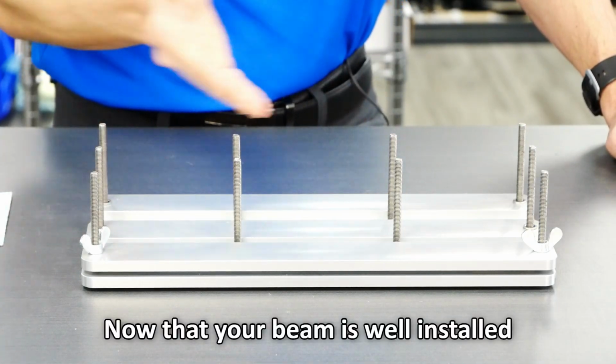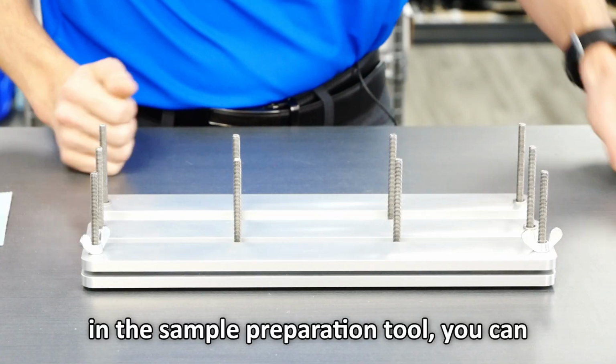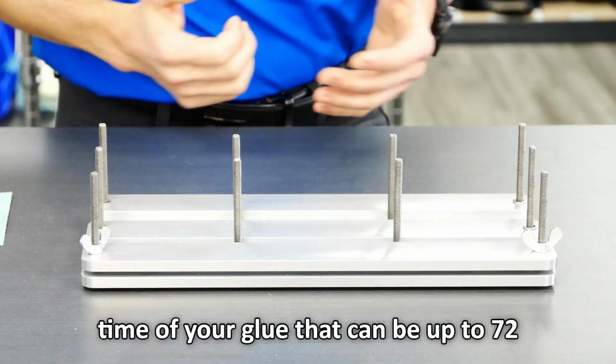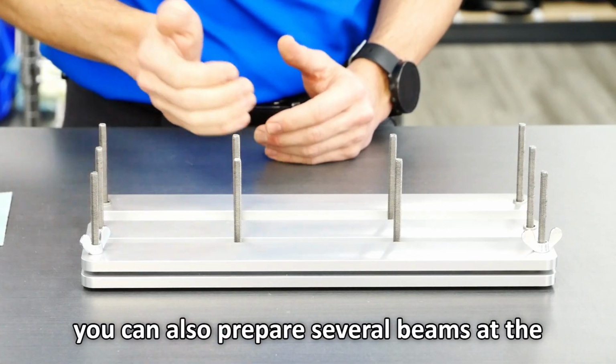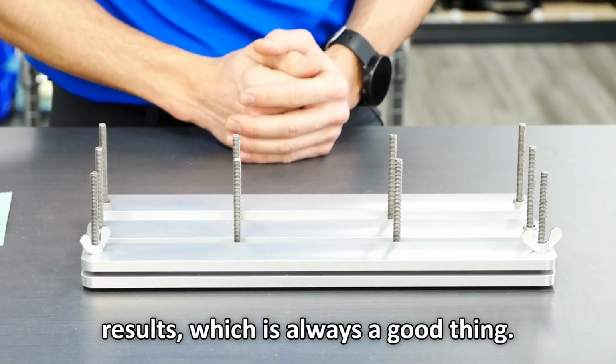And now that your beam is well installed in the sample preparation tool, you can leave it for the curing time of your glue that can be up to 72 hours, as I mentioned. As you can see, you can also prepare several beams at the same time if you want to average your results, which is always a good thing.